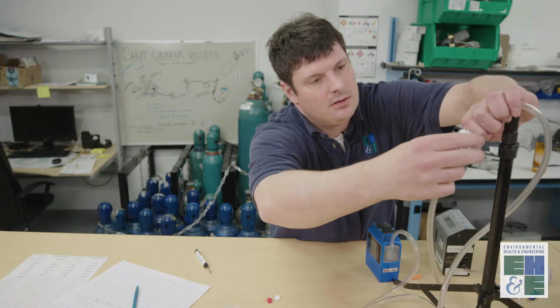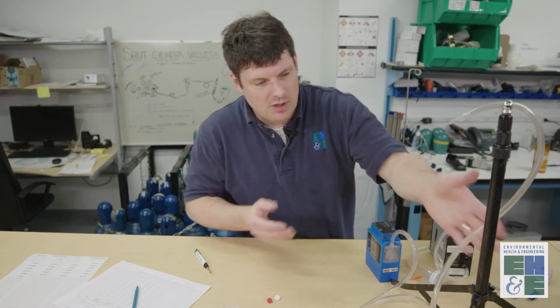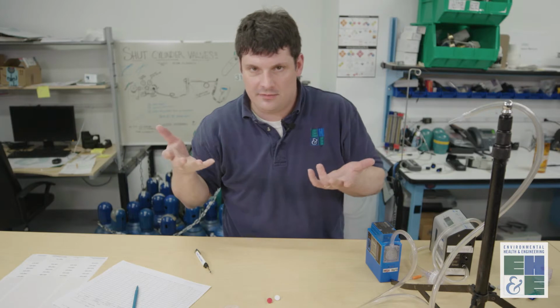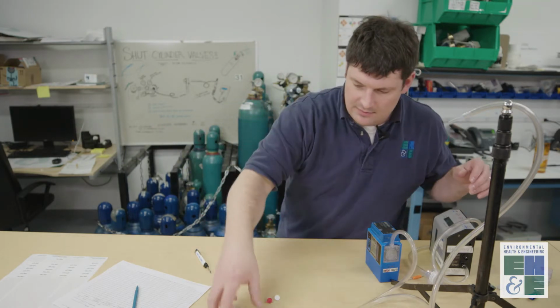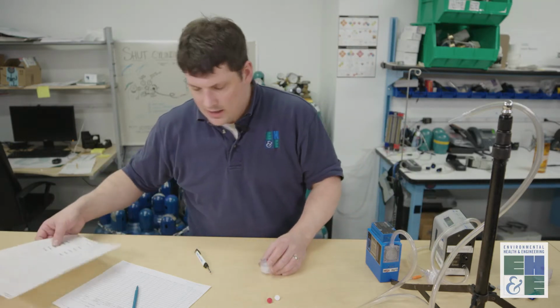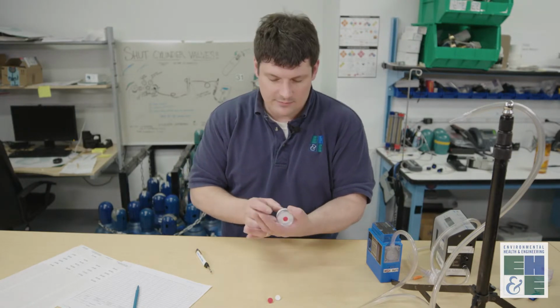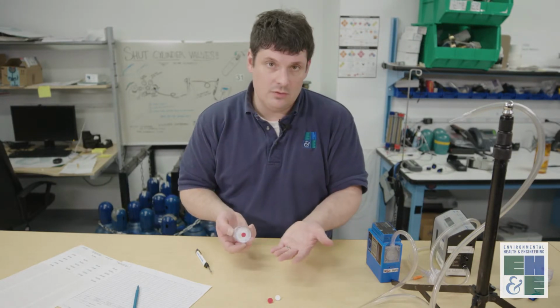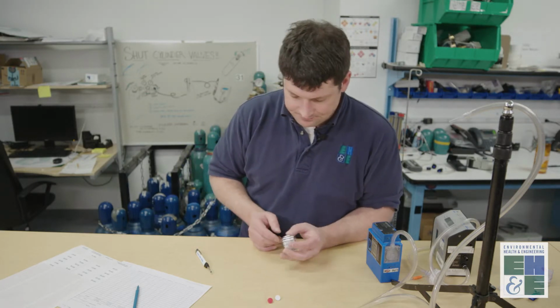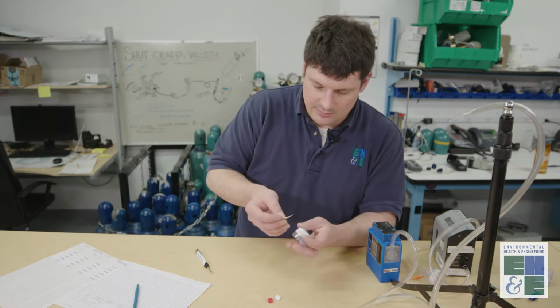So when we use a tripod, we are typically collecting an area sample. We want to make sure that obviously the tripod is raised up to breathing height, between 4 to 6 feet. And now we have our new cassette, not the dummy. Some media types have expiration dates. Some don't. This filter does not, but sorbent tubes do. So we want to make sure that we're always sampling with media that's not expired. So I'm going to take my sample ID in this case and put it on my cassette.